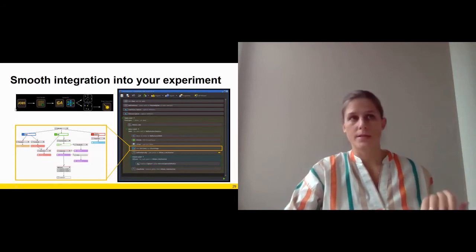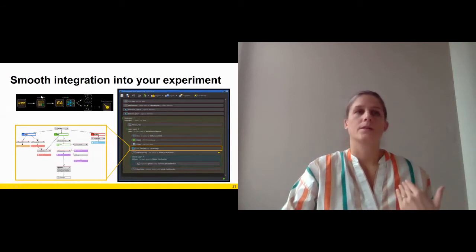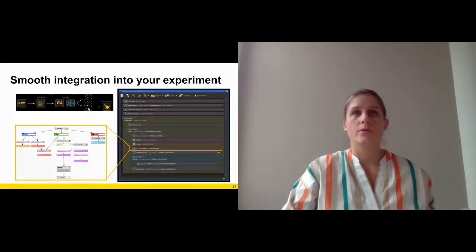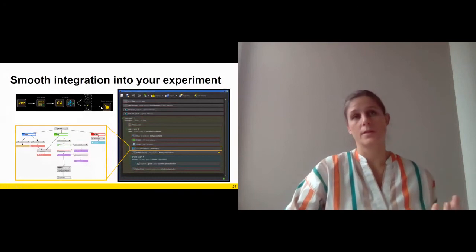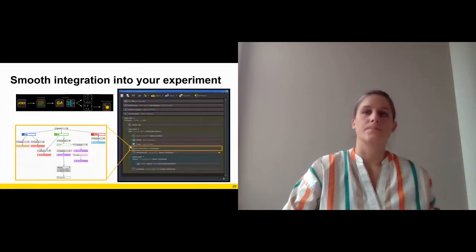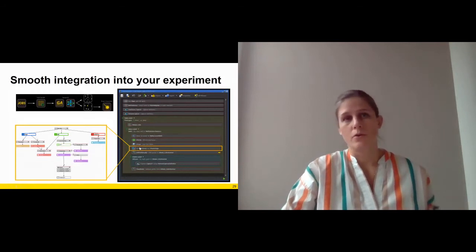We were talking about this yesterday, but the workflow is very, very easy. You can scan your sample, you can use your network, you can identify the cells you're actually interested in, and then you can continue with a more targeted acquisition. So you also avoid a lot of junk data. And the analysis would be just one tab in your protocol.